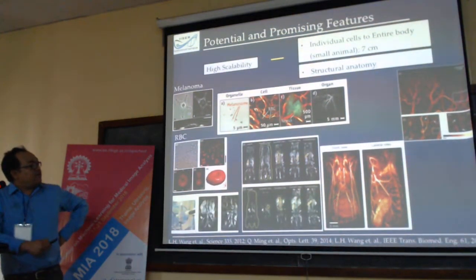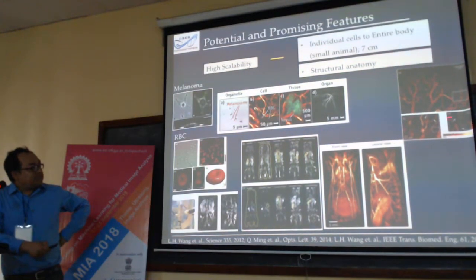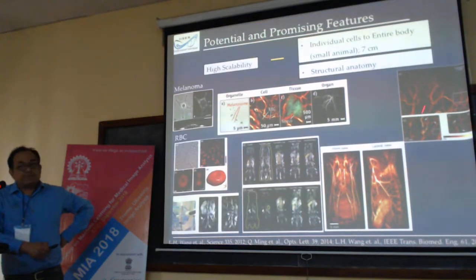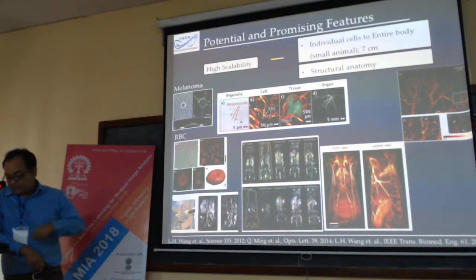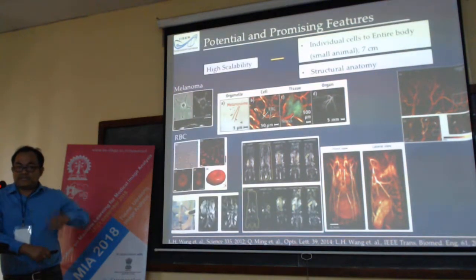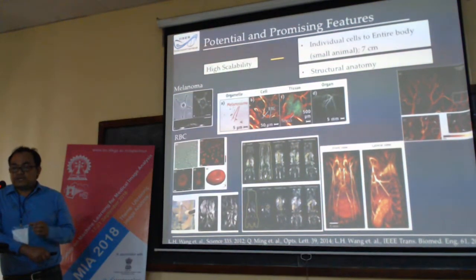And from the structural imaging at multiple zooming scales. So this is zooming at multiple scales by a single imaging unit. Though that is very simple for the optical microscope by changing the objective lens, for the microscopy it is not so straightforward.